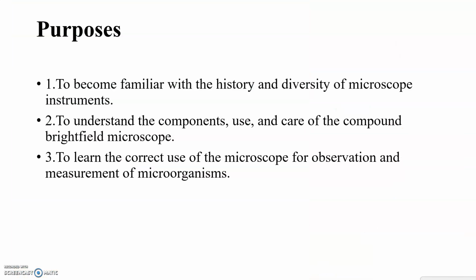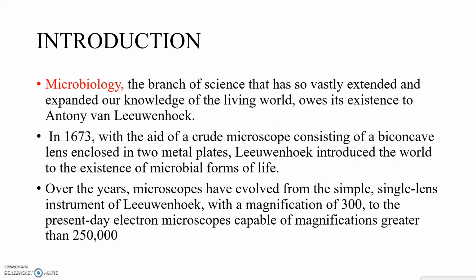Next is the purpose. We already have told the uses. Now next is purpose. To become familiar with the history and diversity of microscope instruments. Then to understand the components, use and care of the compound bright field microscope. To study the components. To learn the correct use of microscope for the observation and the measurement of microorganisms. These are all purposes.